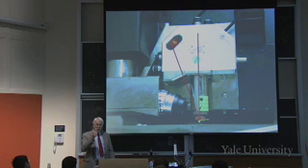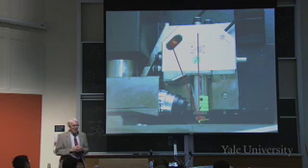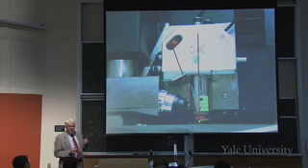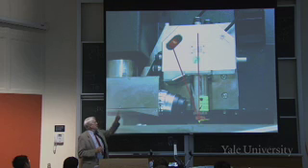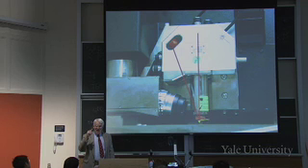It would deviate the reflection, right? It would go like this. And you have a very precise position detector for the laser light up where you see it, the light glowing. So you can tell the deviation of that tip moving up and down by a size that's less than an atom.